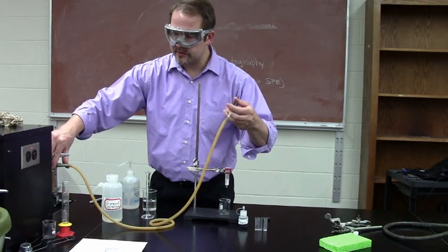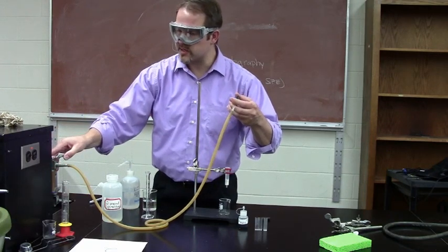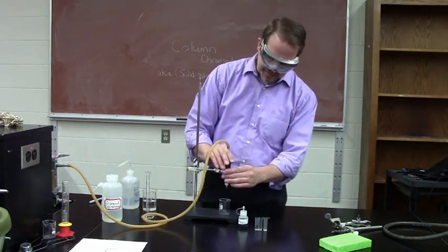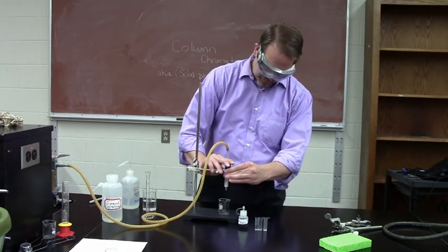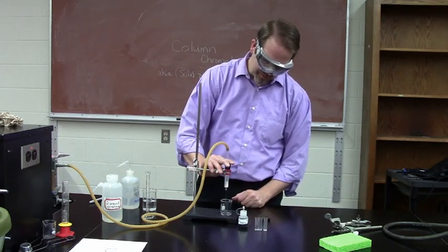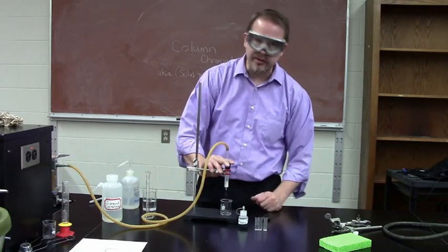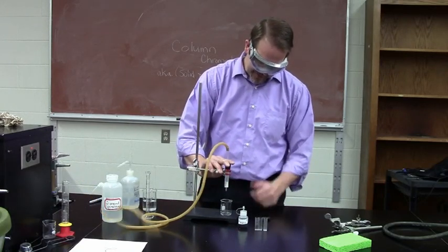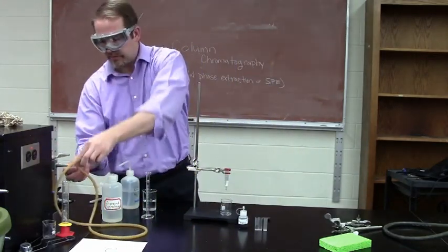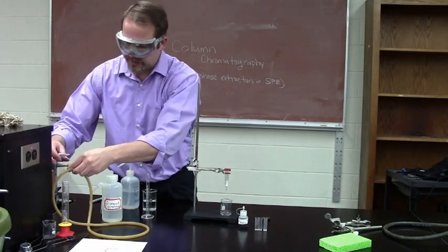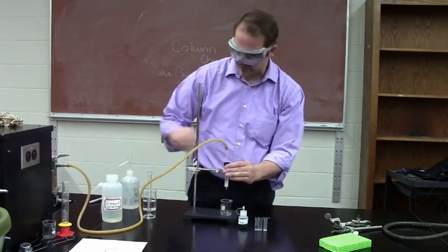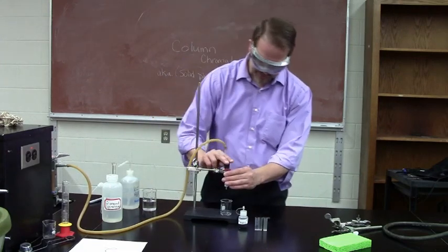We just need a very little bit of air pressure. When we do that, we can put this on top and pressing quite firmly, we can push water through, and hopefully you can see the drops coming out. So we'll just use air pressure to move the mobile phase through the column. This happens a lot. They just pop off because of the pressure that's generated. So you'll have to find a happy medium pressure that will get us going.